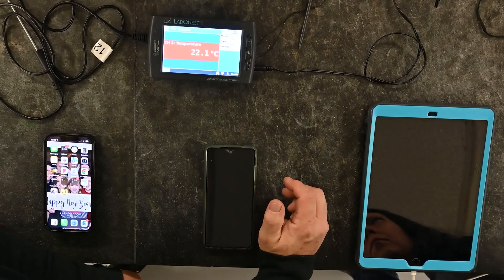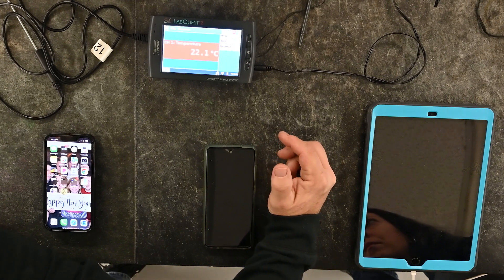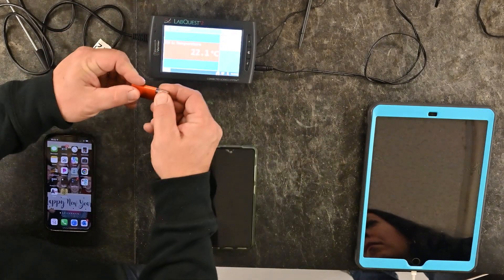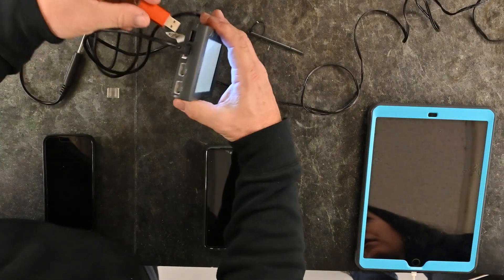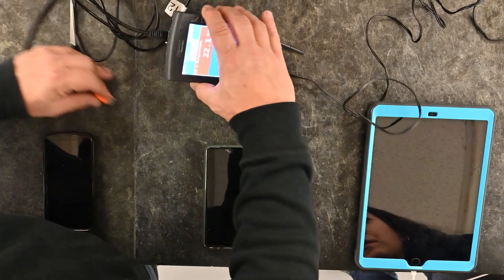Before you start collecting data, think about how you want students to have that data at the end. One option is to run your normal lab and then at the end plug in a thumb drive to the side of the device and save the data to it.